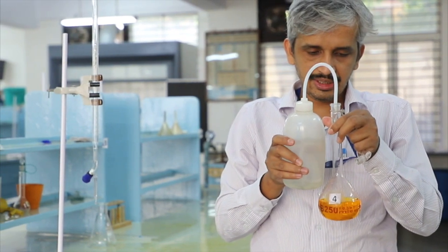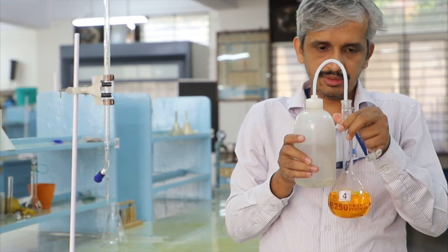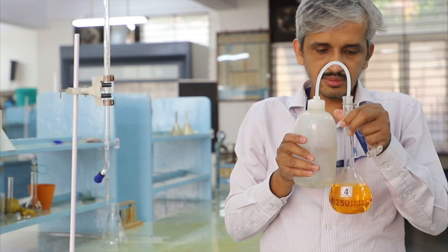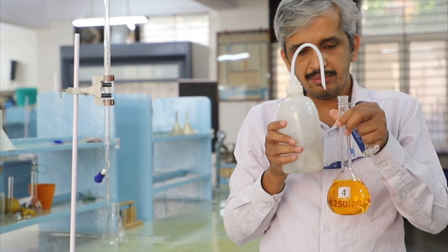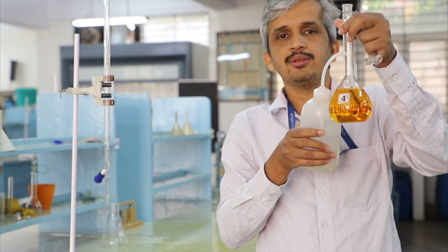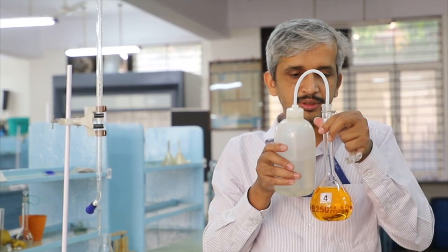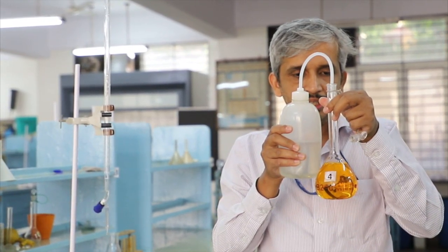Using this wash bottle, here we have distilled water. That means what I am filling inside this is distilled water. Care should be taken to avoid crossing this 250 ml mark. If you cross this 250 ml mark, then we have to discard and restart the process. Therefore, we should be careful. The addition of water should be done very carefully.